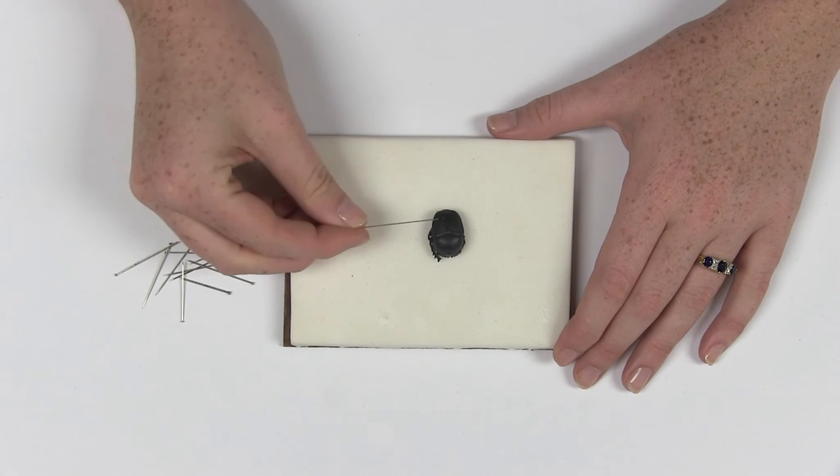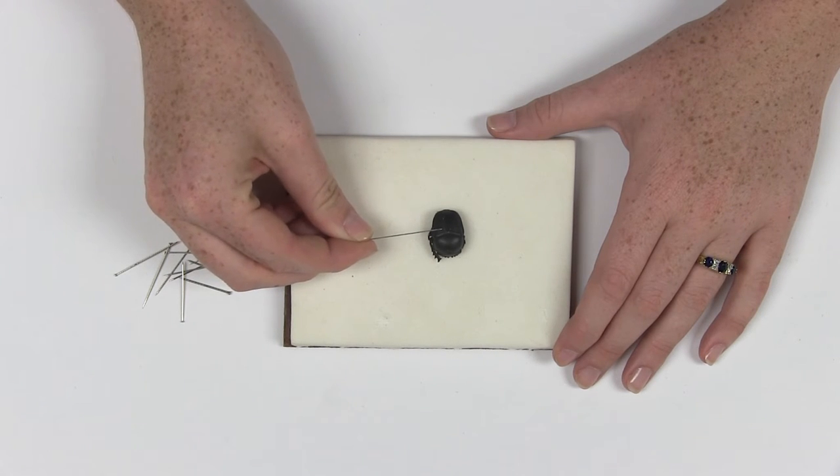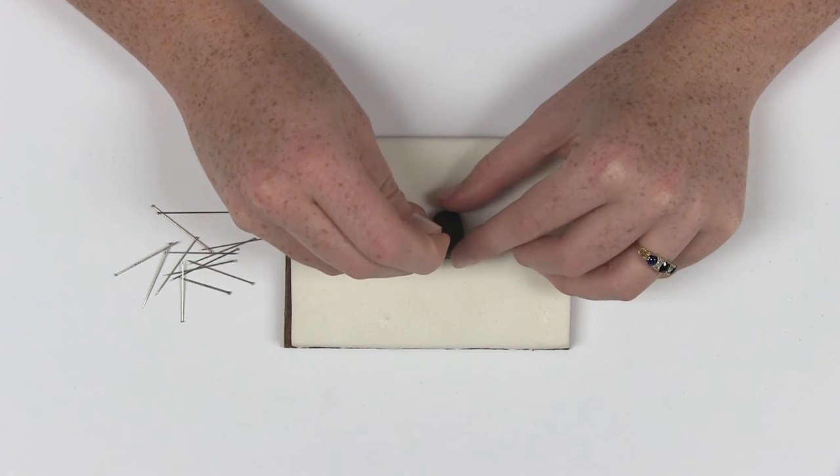Pin the beetle through the right side of the elytron. You may have to wiggle the pin or apply some force because the elytra can be very hard.